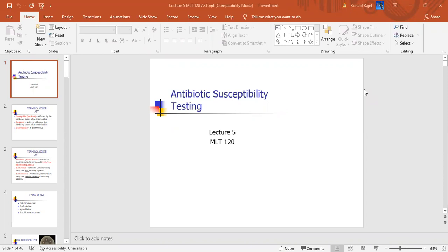I got some MacConkey and blood agar, and I'm just going to have you streak 2 organisms, Staph and Pseudomonas aeruginosa, so you can see what the colony morphologies look like. We're having trouble getting media in, so we're just going to streak on those 2 plates. Tomorrow, you're just going to record your observations, and that'll be it for lab, and then you'll take your quizzes. So short lab today, short lab tomorrow.